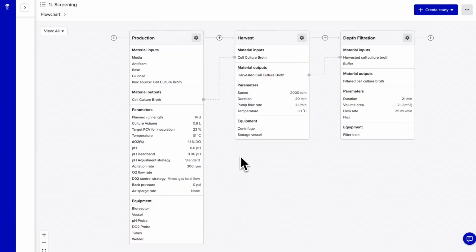Thanks, Arif. My name is Dane Pieri, and I'm a product manager and the solution owner for Bioprocess. I've been working with Benchling's process development customers for a while now, and I'm really happy to show you all a demo today now that it's generally available. I'll walk through the key steps of process development, from designing a recipe to experimental planning and execution, and on through analysis. Recipes are the core new concept backing Bioprocess.